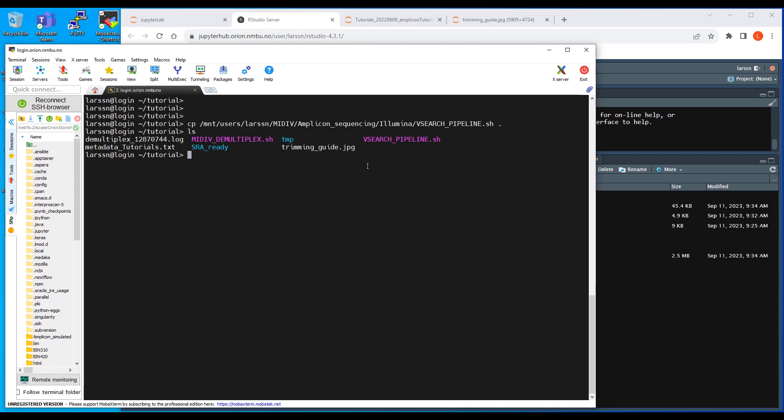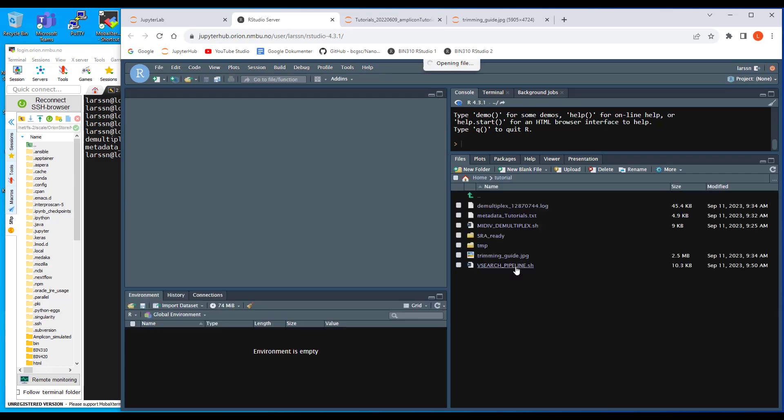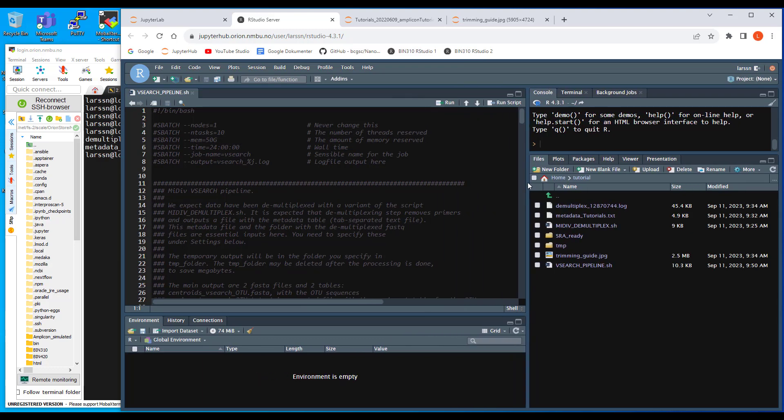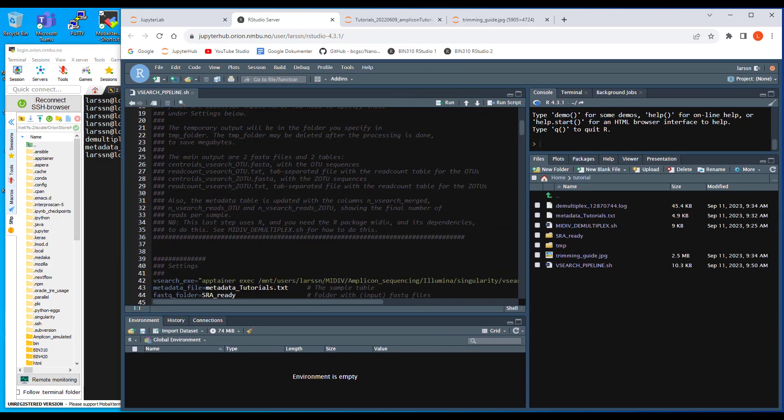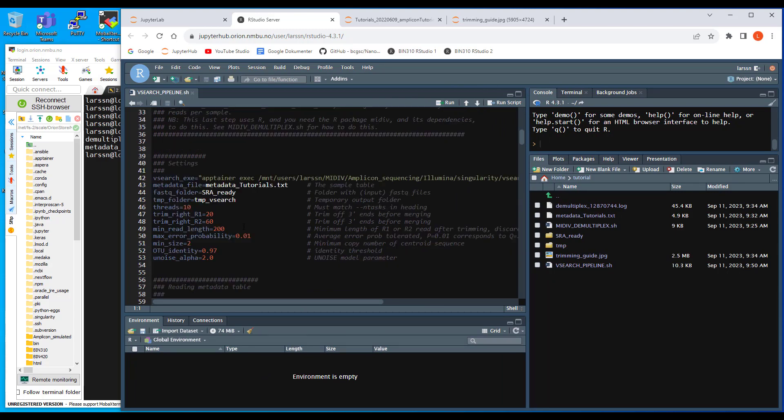So you can see I also now have this and we can go into RStudio, refresh here just to see it's here. Let's click it open. And again, what do you have to edit?